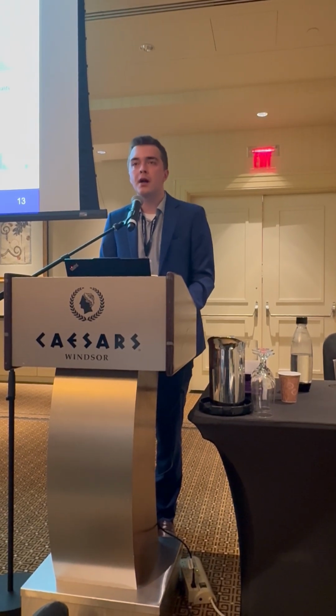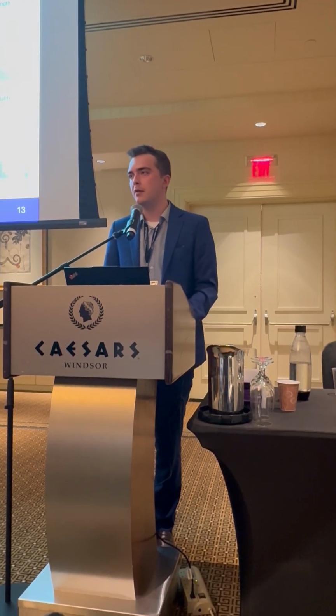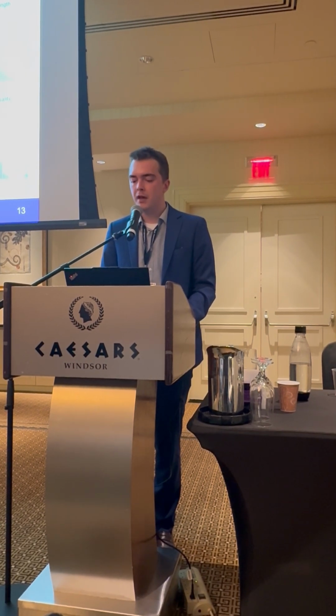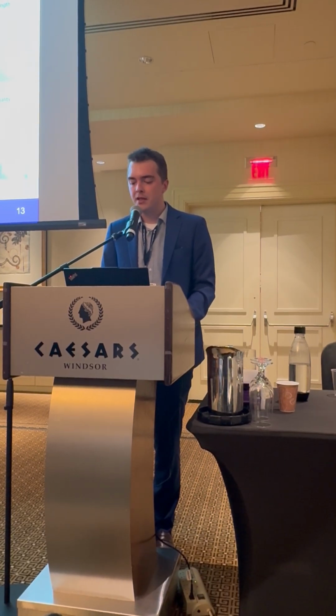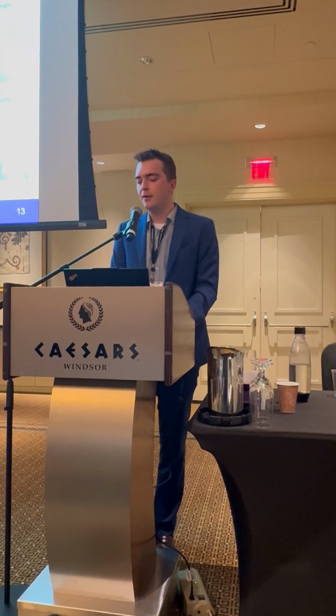On the left here, you can see the TapeStation, showing the raw DNA isolate before going into the library prep. It had really high integrity, with a DNA integrity number, or DIN, of 9.9 out of 10, and it was greater than 48.5 kilobases, so really large chunks of DNA going into the library prep. After sequencing, the raw sequencing data had an average read length of around 18,000 base pairs and an average Phred quality of Q38, so really high accuracy in long reads.